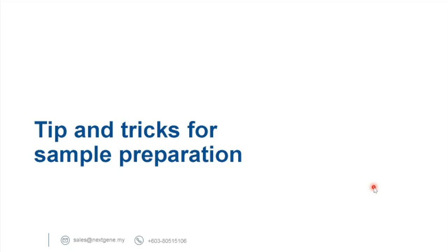Okay, actually I do have. Hi, Chi Hong. Our sample is actually single-stranded DNA, I just want to confirm with you. Ours is single-stranded DNA, and we sent 2 primers over. The result we got back is that one of the primers gave us very good sequencing, and the other one is a lot of noise. Is that normal? So that means our sample is not enough, right?